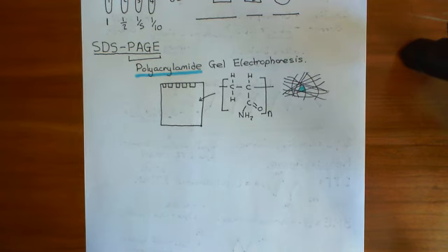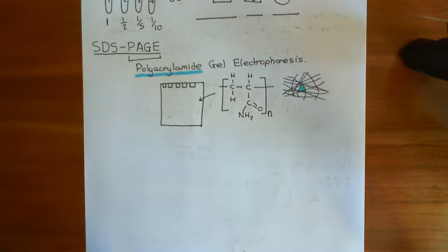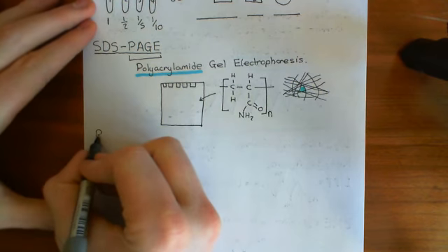So what we're now going to do is load our samples into these wells, but actually I should just discuss one more thing before we do that. I just want to discuss what a running buffer is. So I'm going to discuss with you the concept of a running buffer.